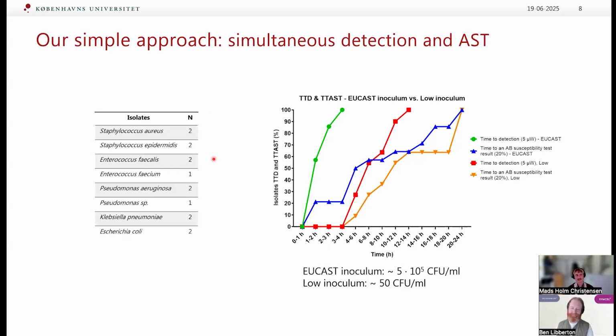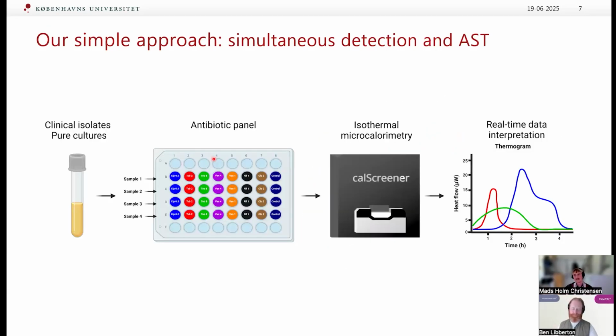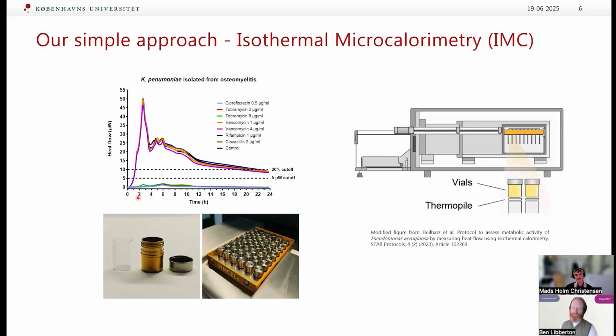Yeah, I definitely think that when we see the heat flow like this, we see it live on the screen as we're measuring next to the instrument. And that is, of course, the main output. But I think it's really important to look beyond the heat flow curves as well and try to analyze and see what this data hides.